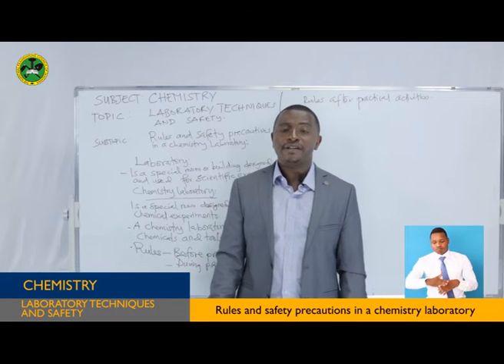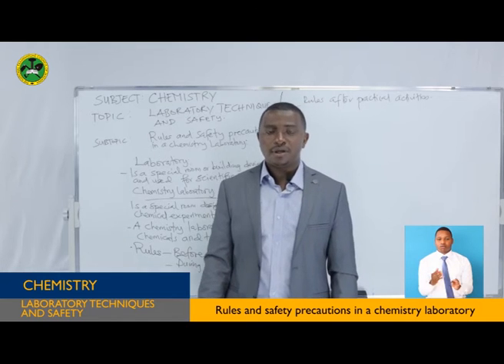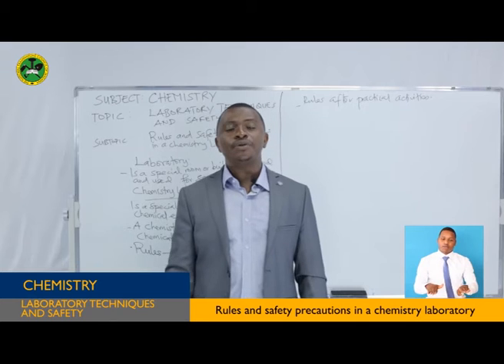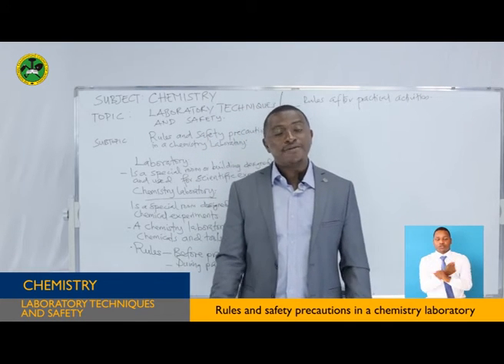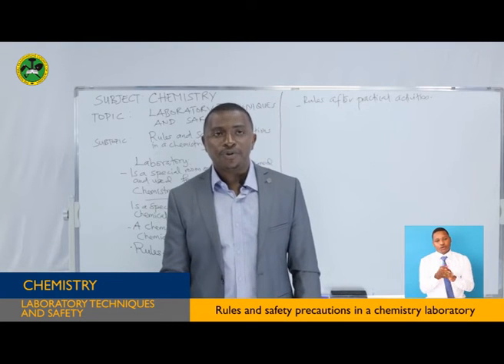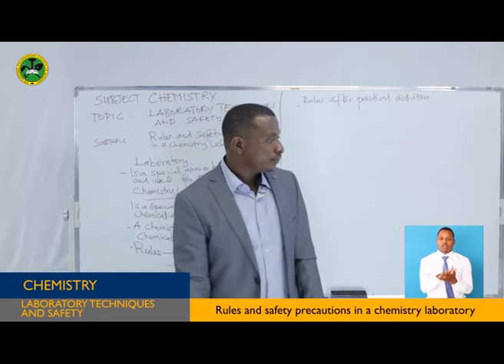Wash them properly and thoroughly, because washing your hands after practical activities keeps you safe. It prevents you from being contaminated with poisonous, toxic, or harmful chemicals. So you better wash your hands with a lot of water and soap so that you can be safe.